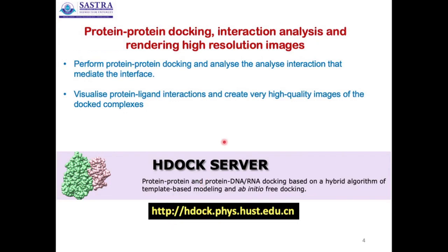Today we are going to see how protein-protein docking can be performed using a powerful tool called HDock, which can be accessed through the web portal hdock.phys.hust.edu.cn. We will also see how to analyze the interactions that mediate protein-protein interactions, and I will show the procedure to render high-resolution images that can be used in presentations, reports, and posters. This exercise will equip you to perform protein-protein docking and analyze the interactions that mediate the interface of protein-protein complexes.